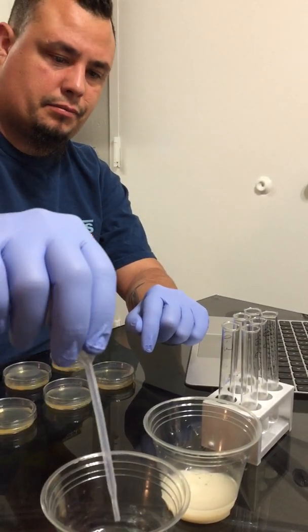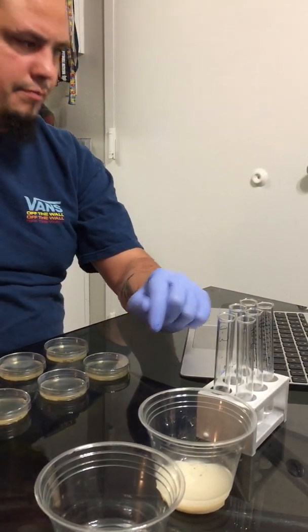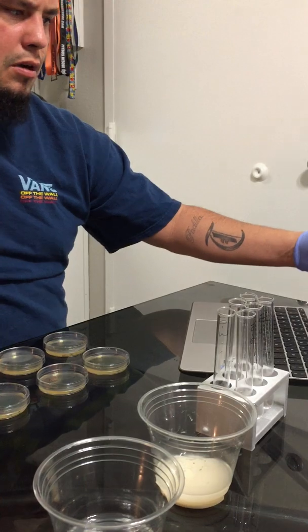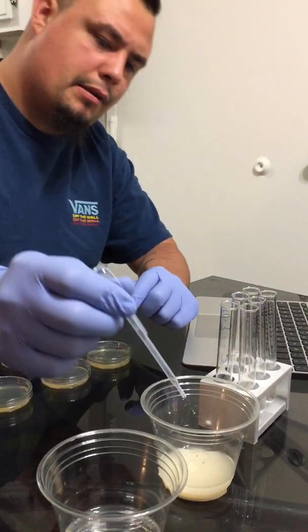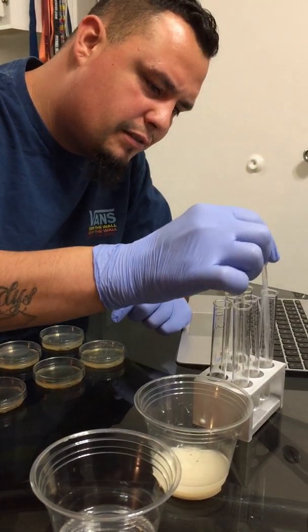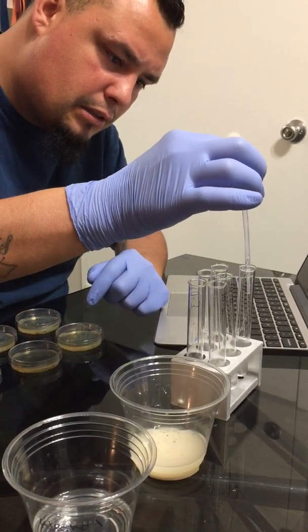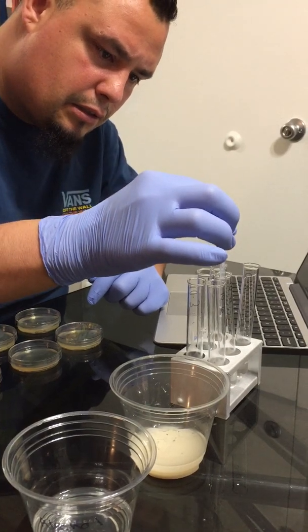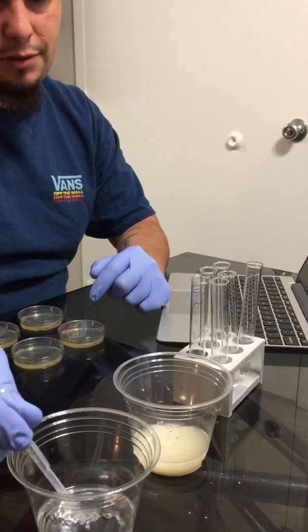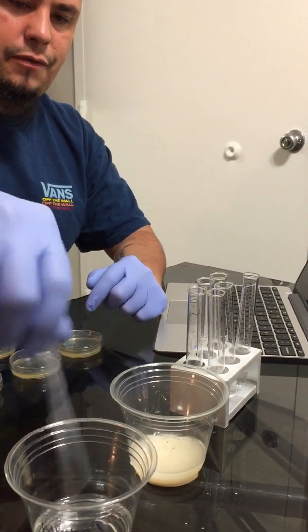Sterilize the pipette again. And we're going to repeat this process through all the tubes. This is going to go from 4 to 5. The balancing game with these tubes as well. So that was 4 into 5. This is the last transfer. We're going to go 5 into 6.